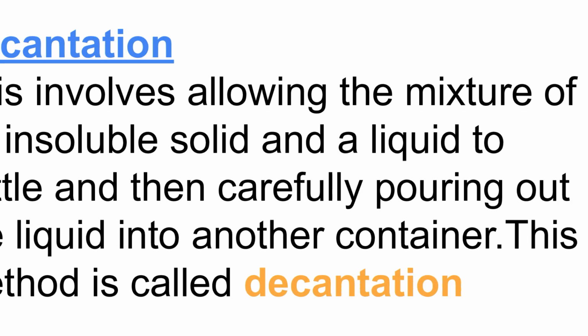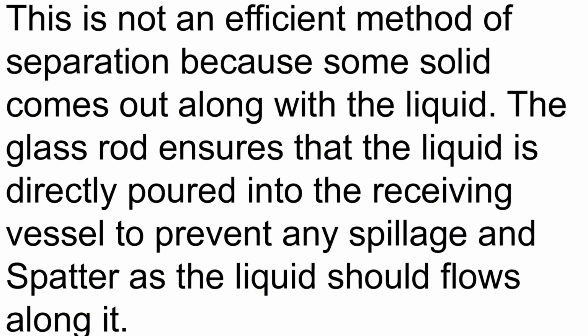Now, the other method of separating an insoluble solid-liquid mixture is decantation. This method involves allowing the mixture of the insoluble solid and a liquid to settle, and then carefully pouring out the liquid into another container. The decantation setup is as shown in the diagram below. In this diagram you can see the already settled mixture is being poured along a glass rod into the container.